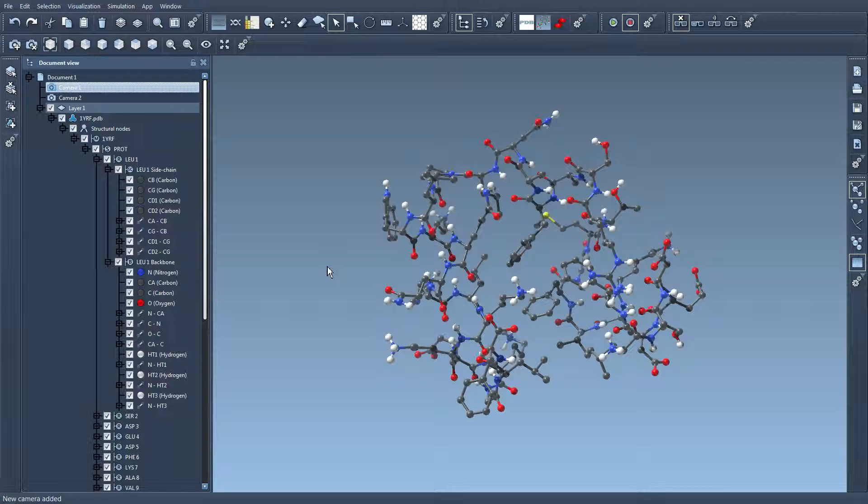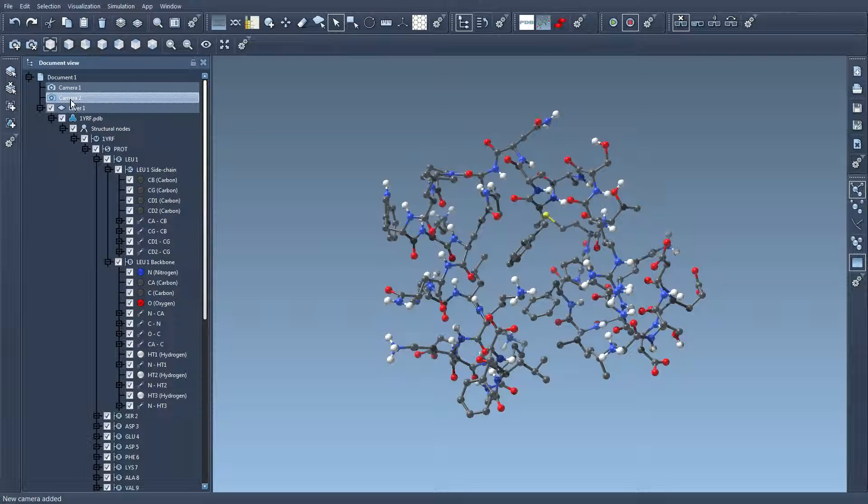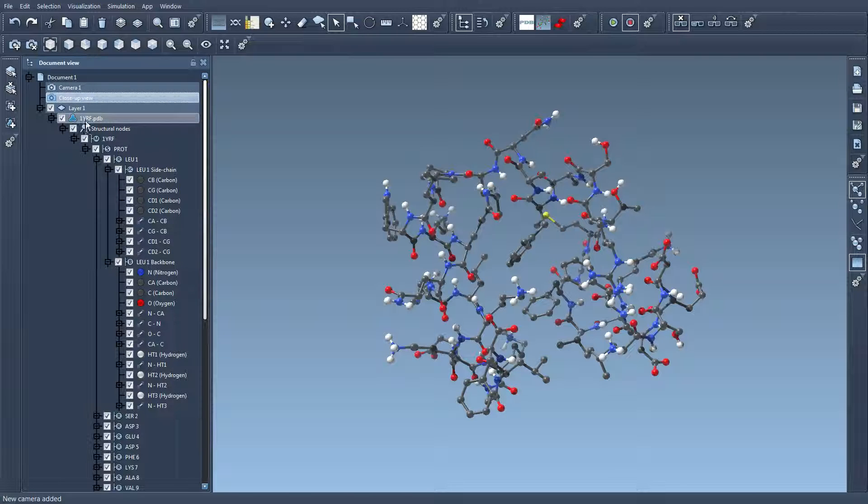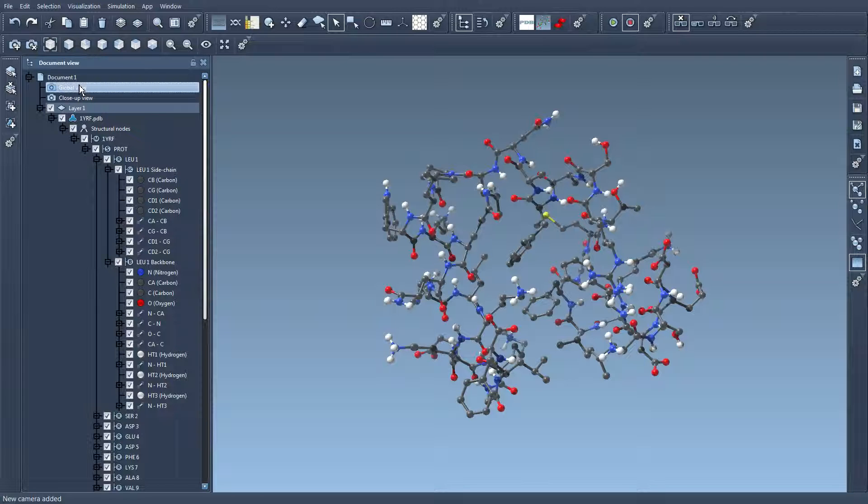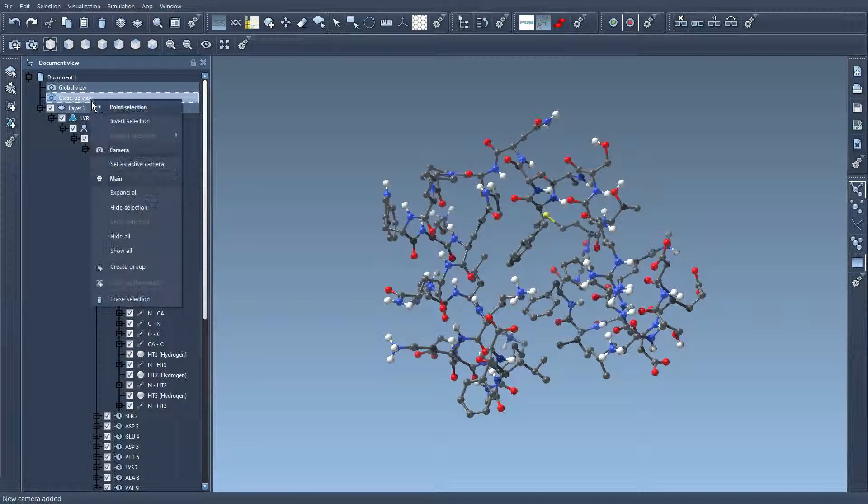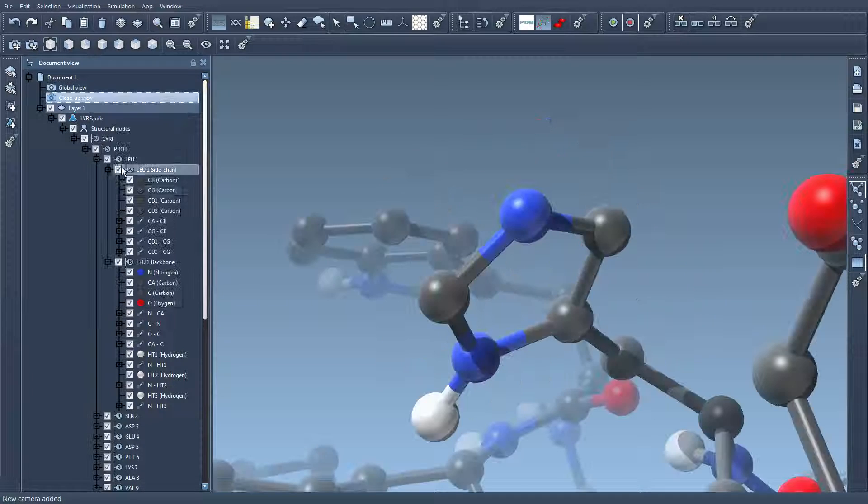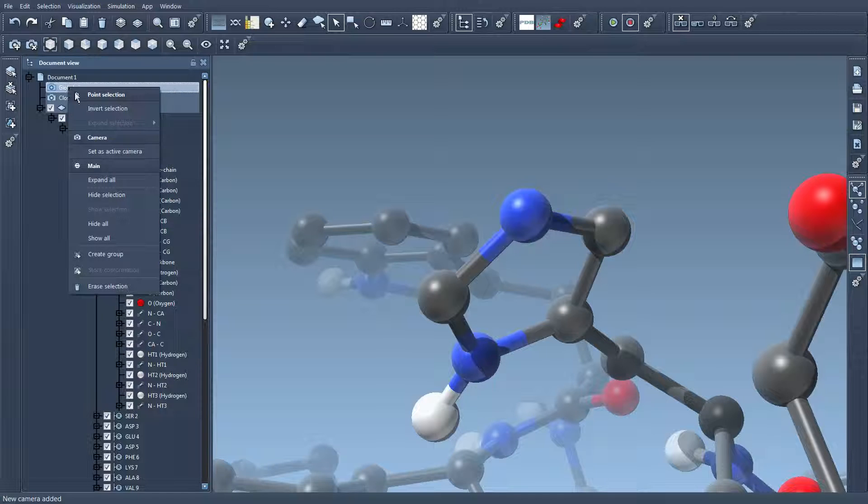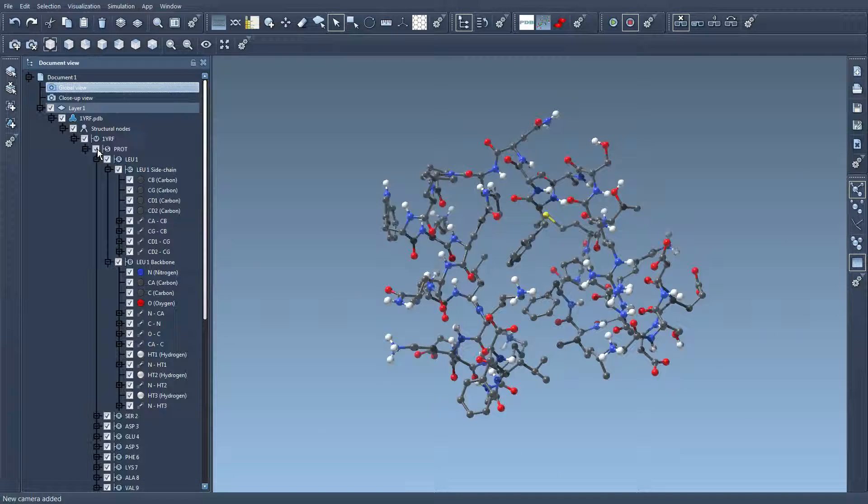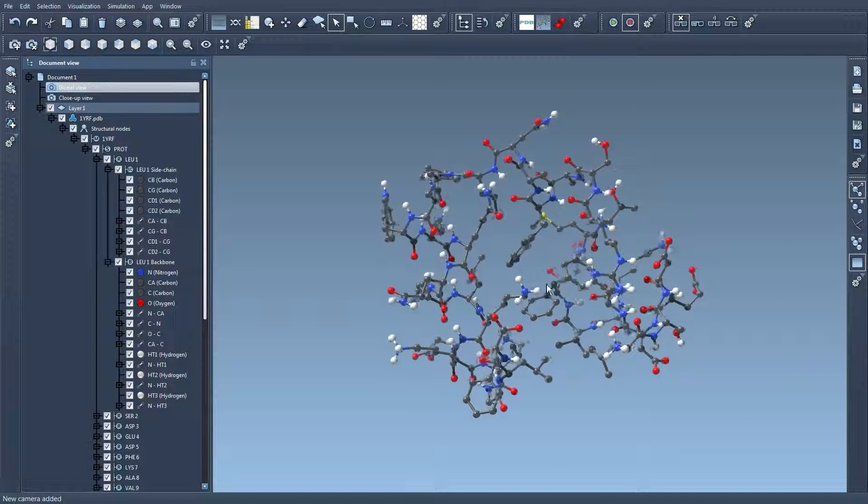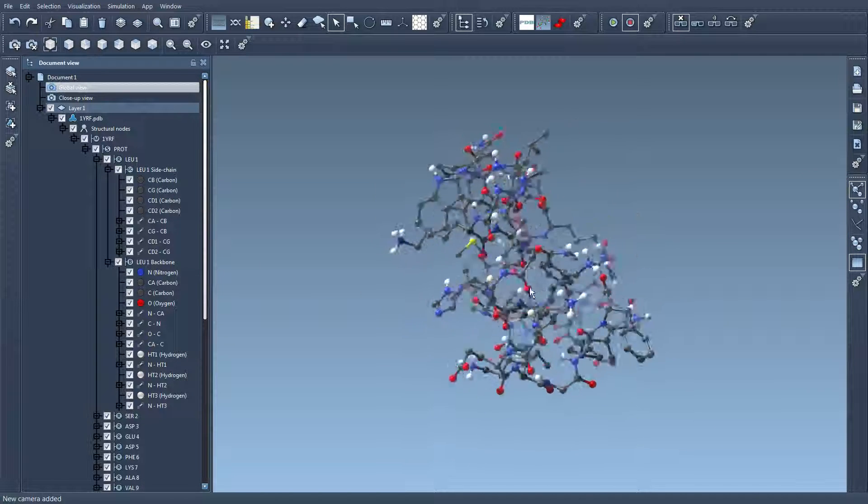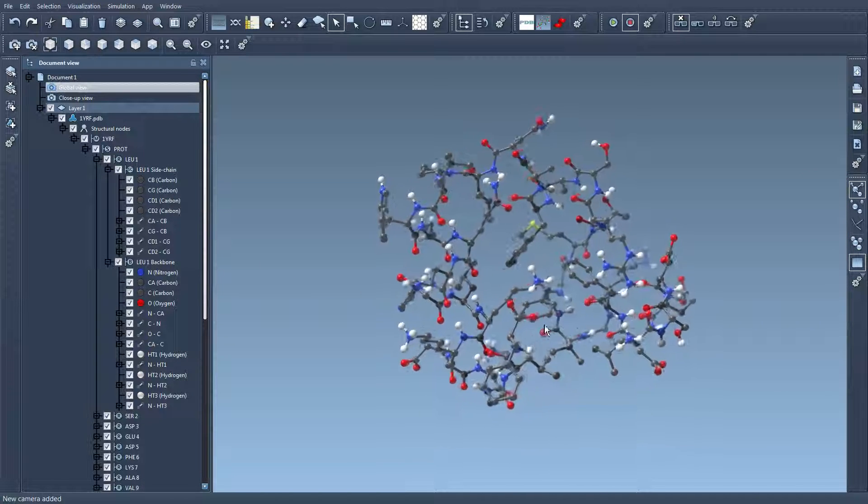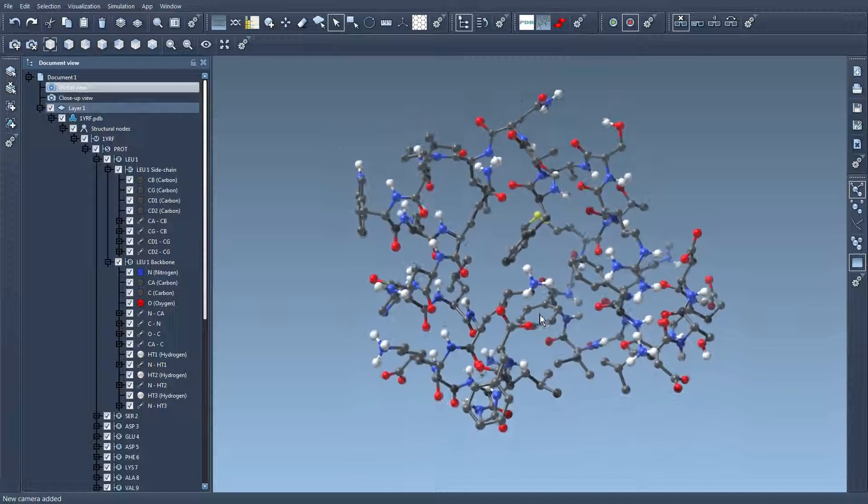And if it makes it more clear for me, I can just rename them. So let's say close-up view here and global view here. So I switch between these two cameras to manipulate the view.